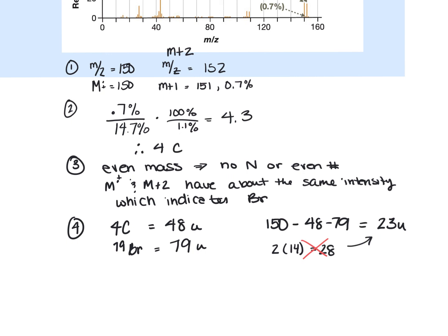So the question here with step 5 is, can the remaining mass be accounted for with just hydrogen atoms?